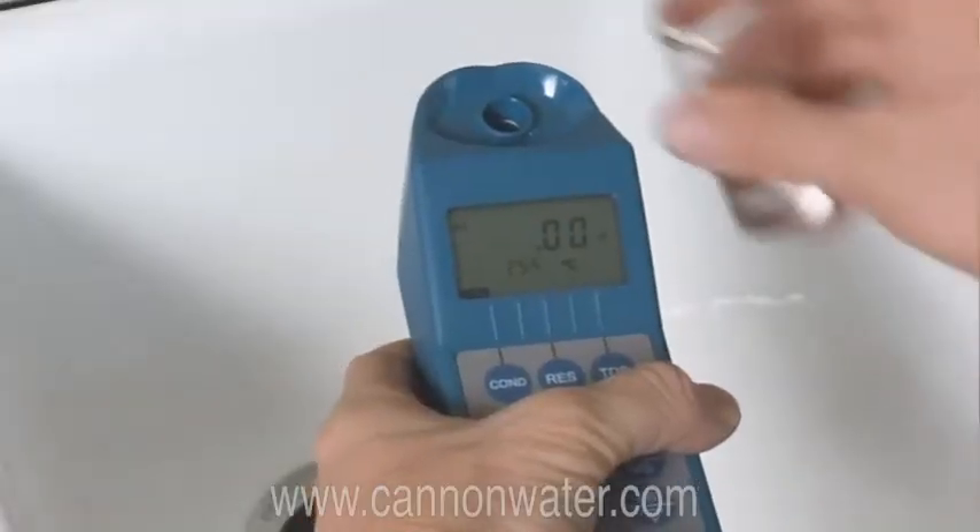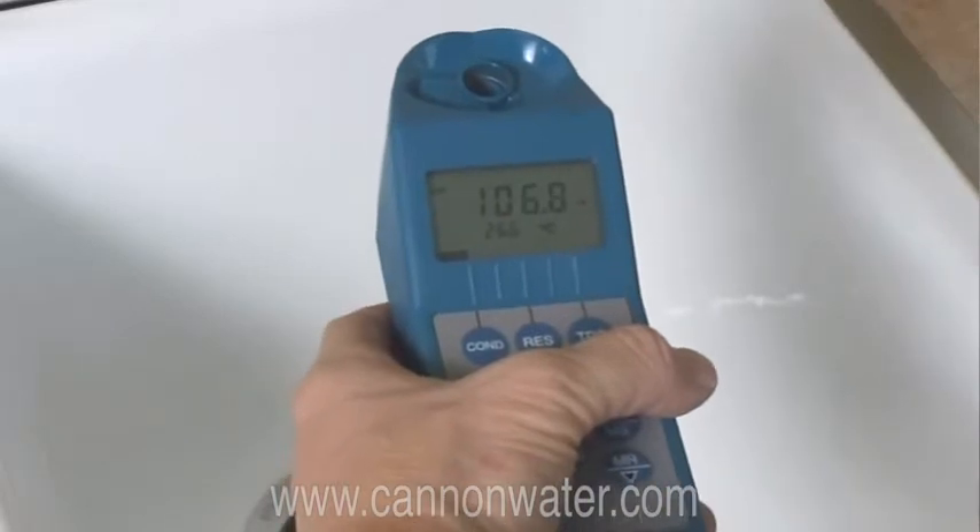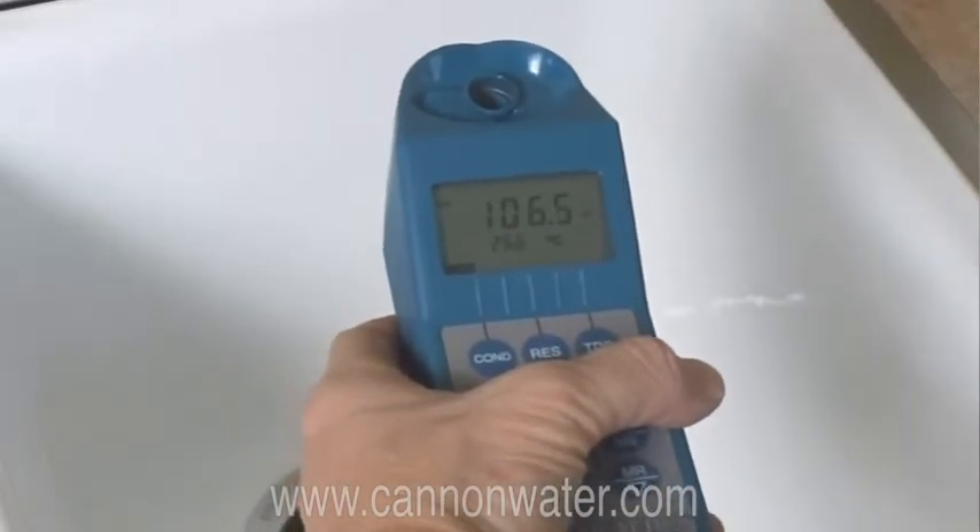It is as simple as pouring your sample into the sample well, and if you are measuring something like conductivity, just press the button and it will automatically measure the conductivity and compensate for room temperature.